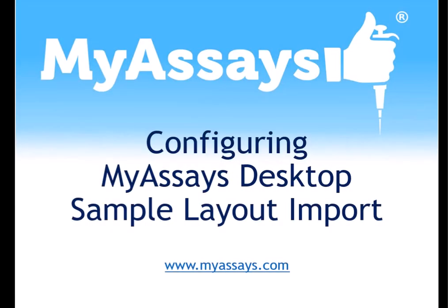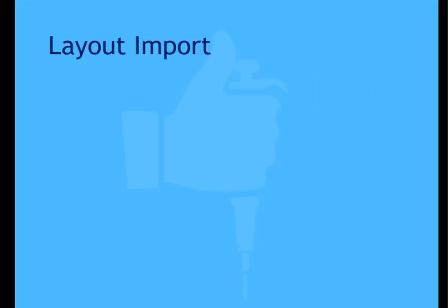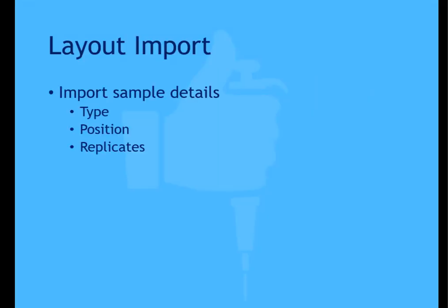In this video, I'll demonstrate how to configure importing layout information into a MyAssays Desktop analysis as part of an automated workflow. For an overview of this feature, please see the associated video.